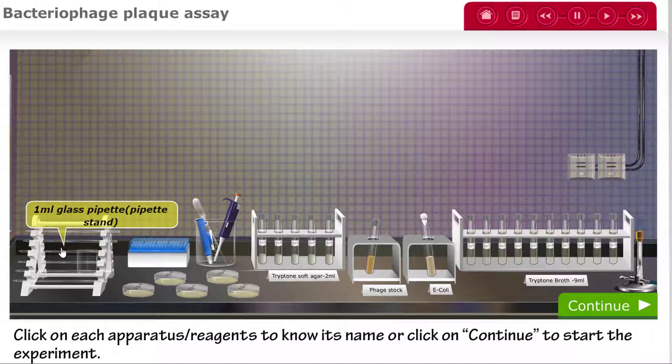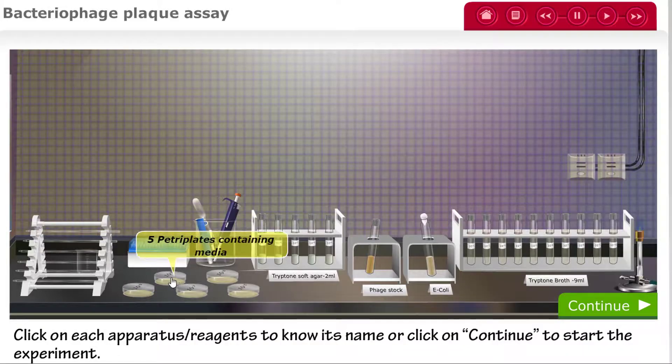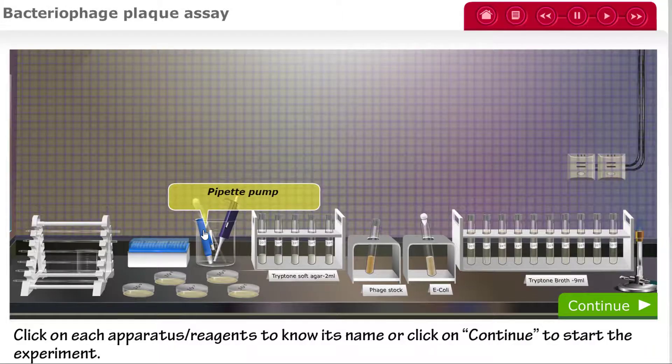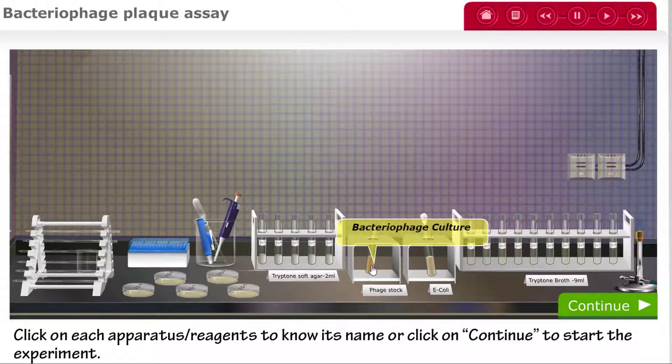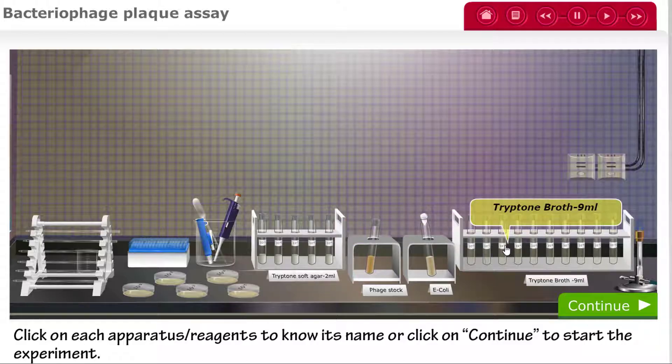You will need 1 mL glass pipettes, pipette tips, 5 petri plates containing media, a pipette pump, a Pasteur pipette, and a micropipetter, 5 vials of 2 mL tryptone soft agar, phage stock, E. coli culture, and 9 mL aliquots of tryptone broth, along with a Bunsen burner.